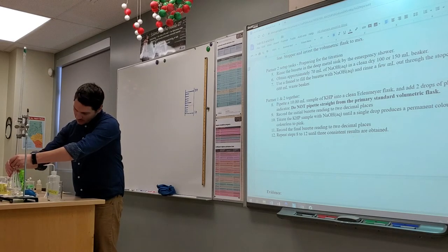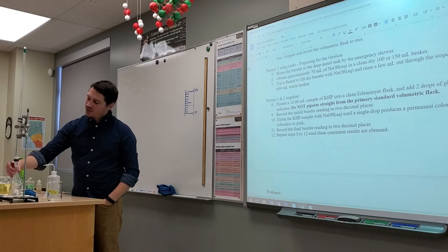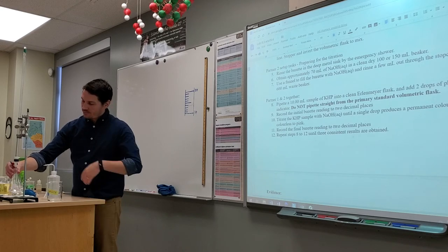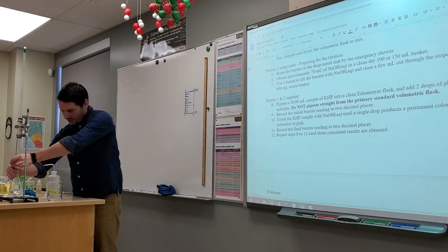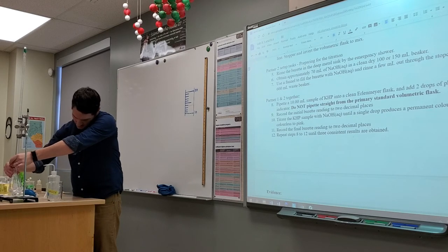And this time I'm gonna go drop by drop. And once you know you're close, you just go drop by drop. And you want the most pale shade of pink that you could possibly imagine. I know it's tough, I get that.